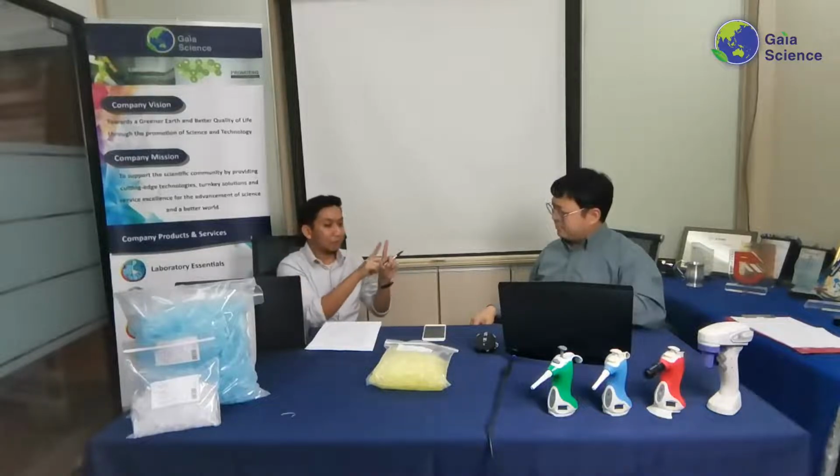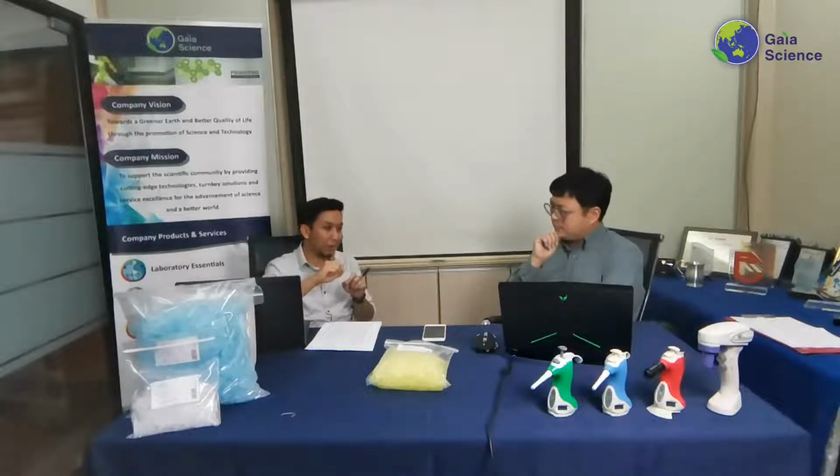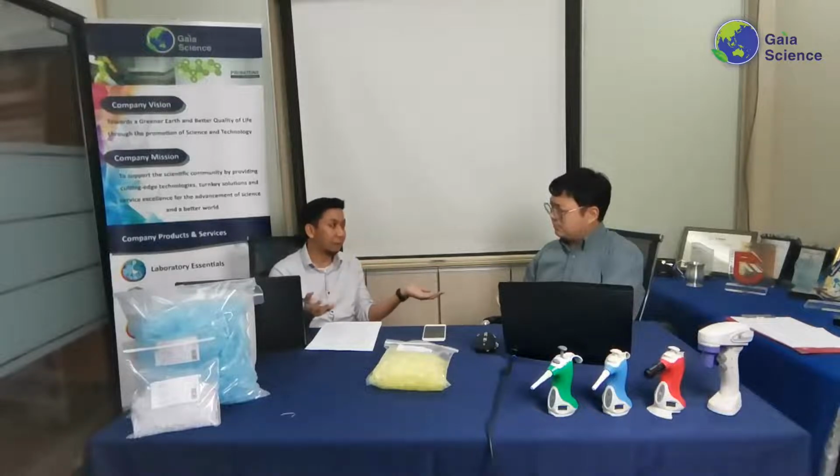If this pipette is used inside the biosafety cabinet, you cannot take it out, because they're afraid that when you aspirate a different liquid, some contamination will stick to the pipette and you'll bring it into the biosafety cabinet. I think these are things that also have to be considered if you're not using filtered tips. This might happen, right?